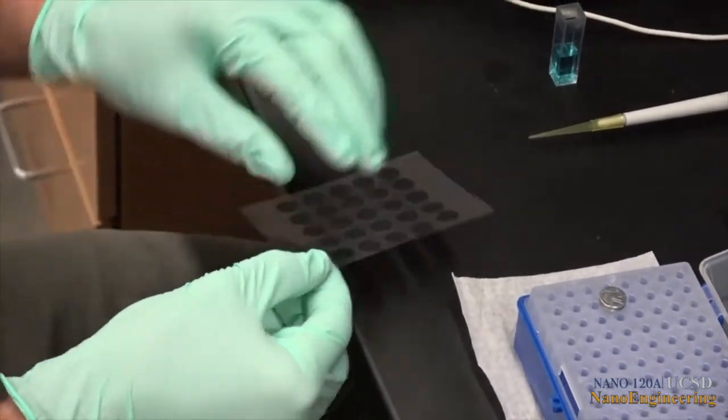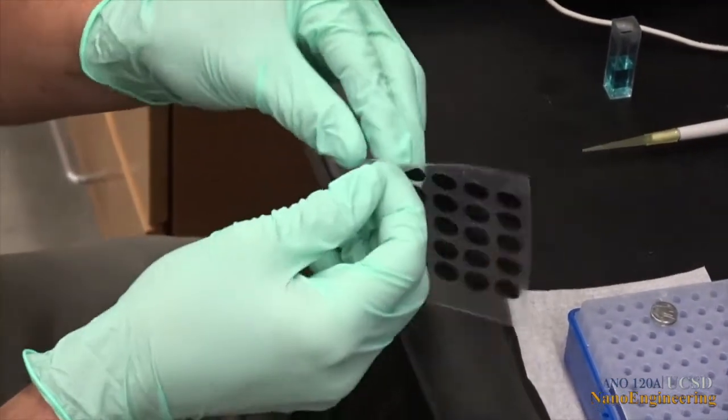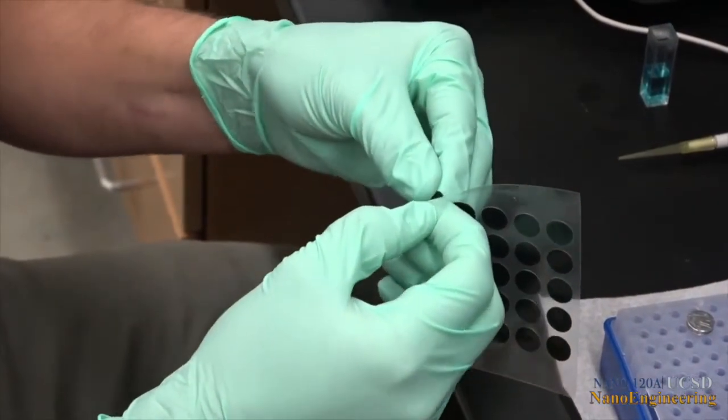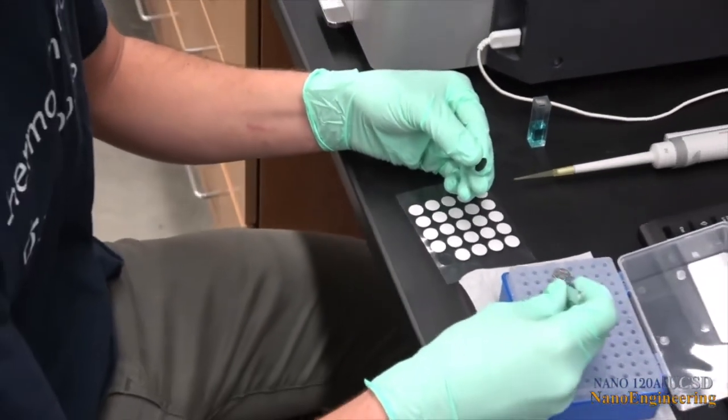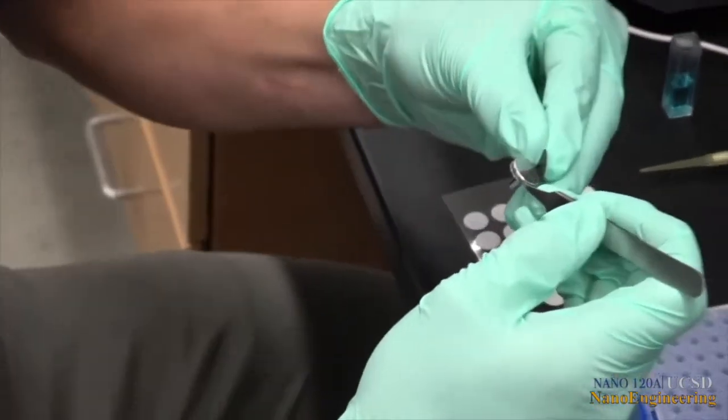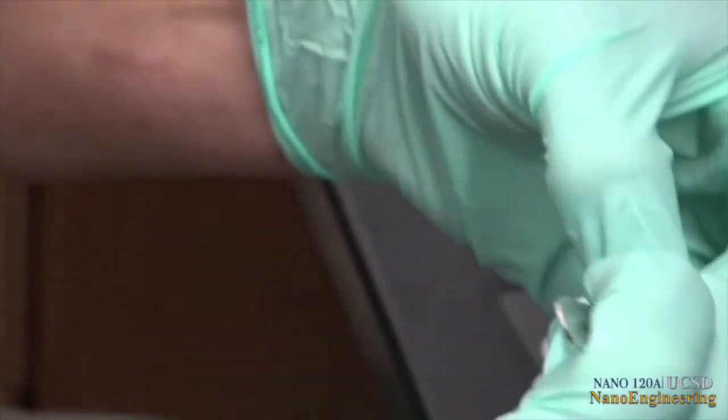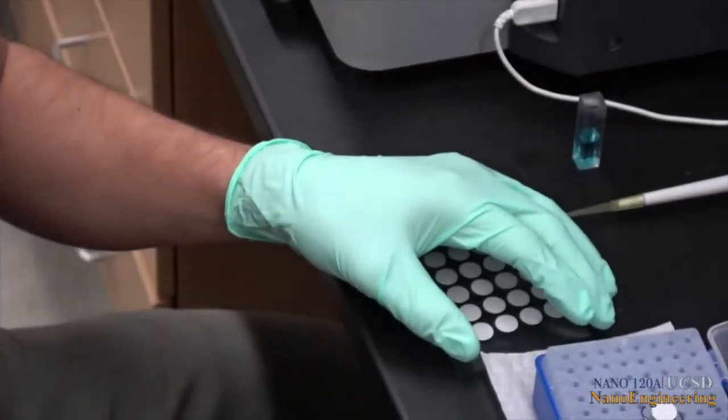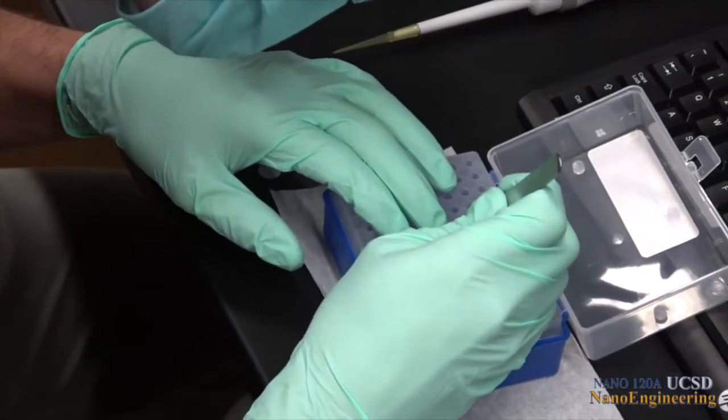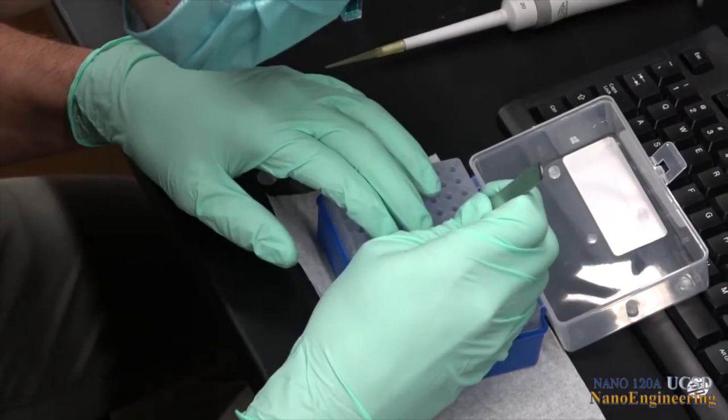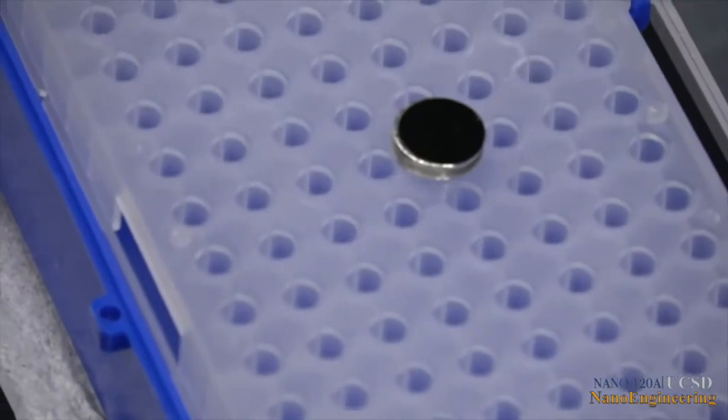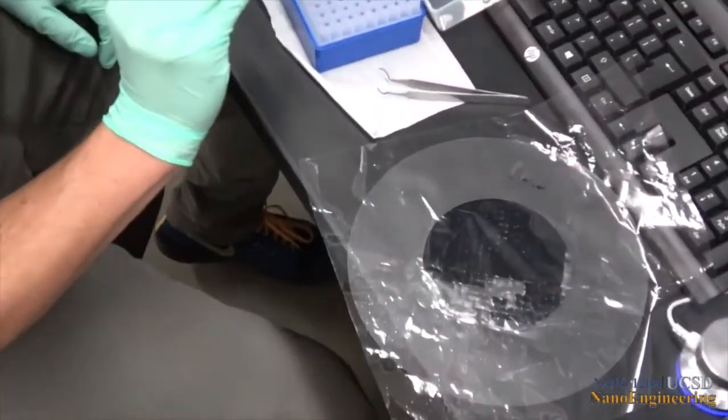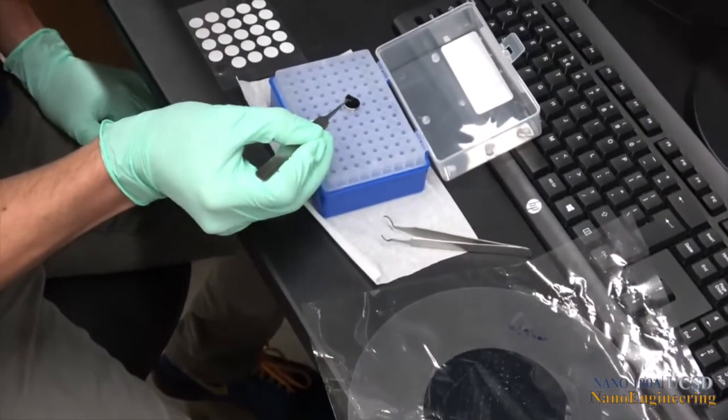Since many of the samples to be prepared for the nanolab are obtained from colloids, we will show a brief sample preparation for this case. First, secure a piece of the black carbon tape to an SEM specimen mount. Next, place a piece of silicon on the carbon tape.